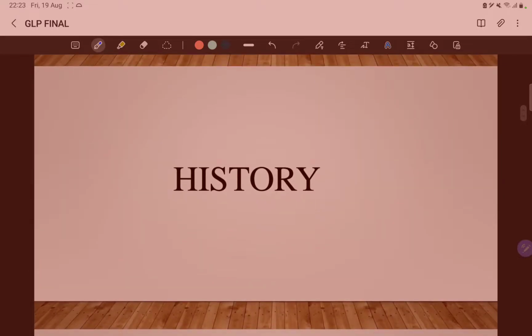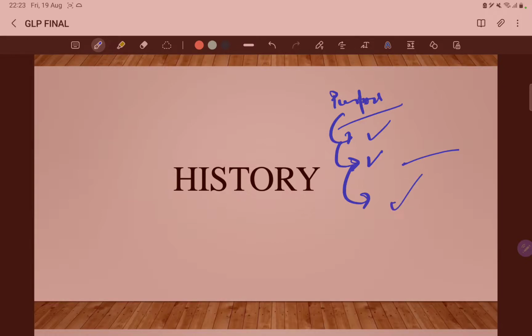Now, what is the purpose of GLP? The purpose is to certify that every step of analysis is valid or not. Right? It assures the quality and integrity of data submitted to FDA in support of the safety of the regulated products. GLP has heavy emphasis on data recording and specimen retention. So maintaining the documentation is very important. So this is the importance of GLP.